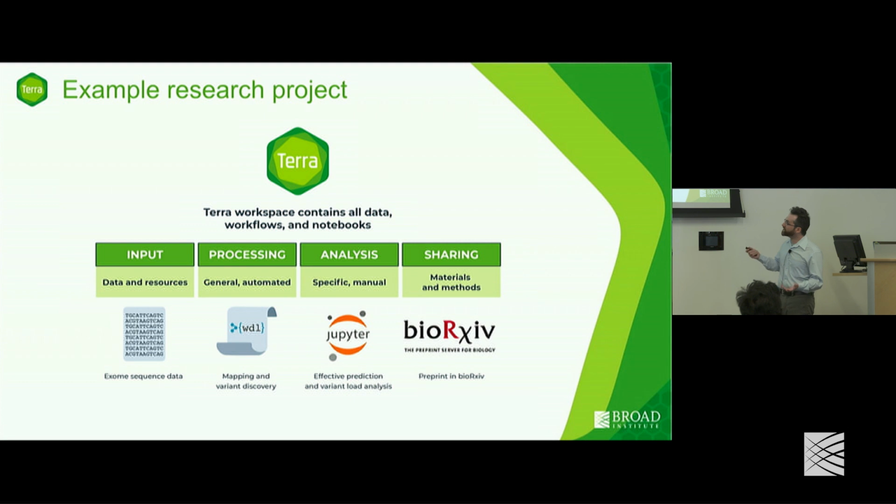And in addition to that, there are all these amazing sharing capabilities that Terra provides, both internally within a laboratory, so you can work with your own colleagues or with collaborators outside of your laboratory, but also it provides a very nice way of sharing published results. So you can actually publish basically the URL to the workspace that you want to present to the world, and then others can come and see how you actually got your results.